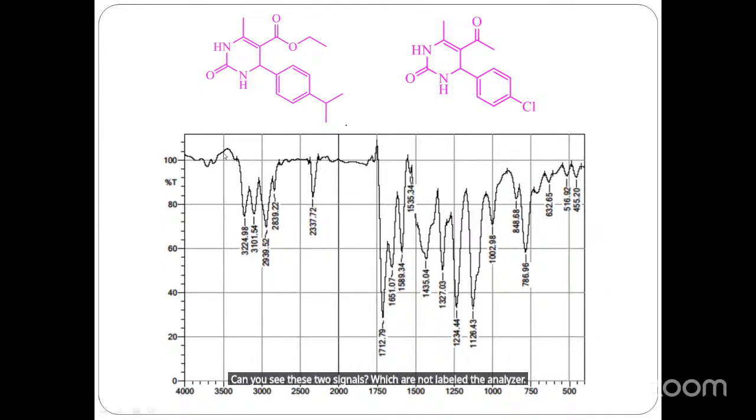Can you tell me to which groups these signals close to 3500 belong? Is there any such group in this compound?